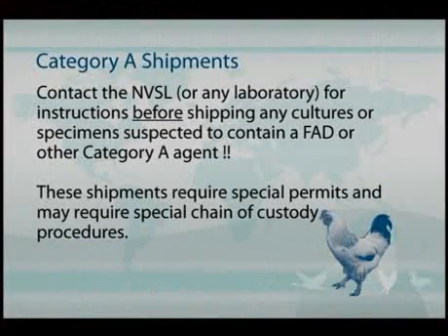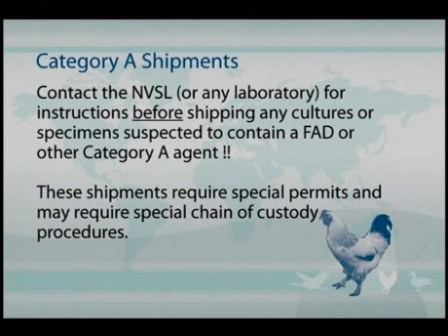Now, as far as shipments of Category A, I'm not going to go into any detail on what the requirements are for these agents, but it is important that if you're going to send a Category A agent to any laboratory in the world, you need to contact that laboratory prior to sending the samples and see if there's any permits that may be required to accompany those samples in shipment.